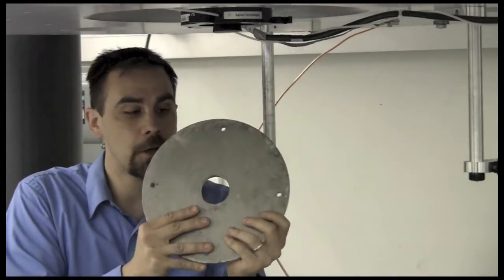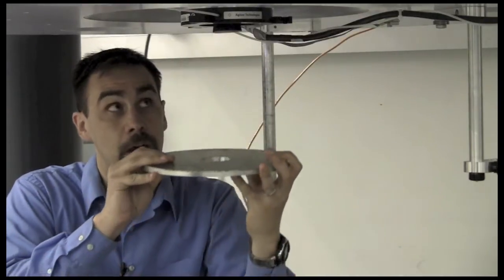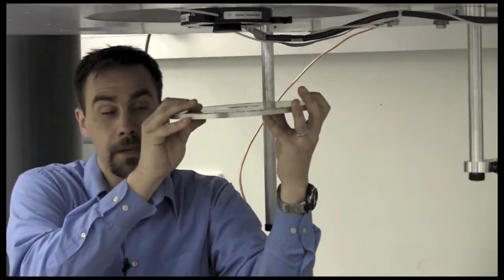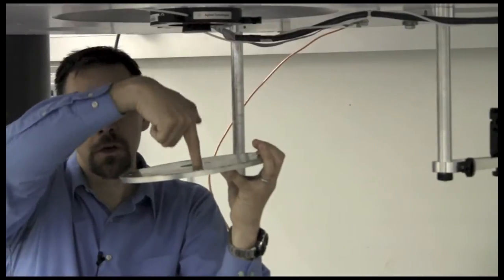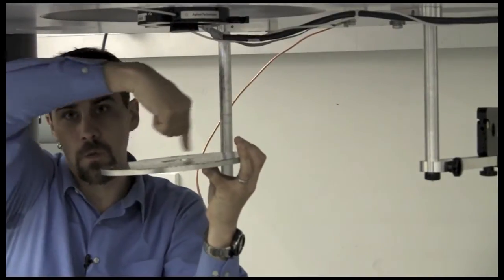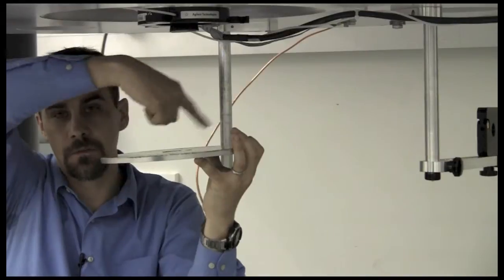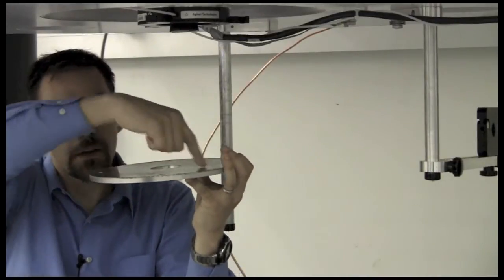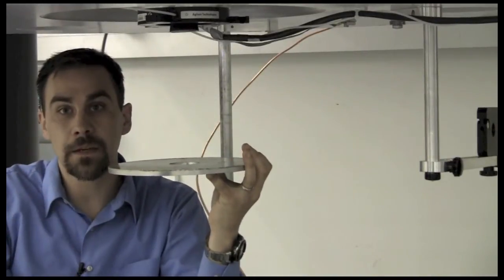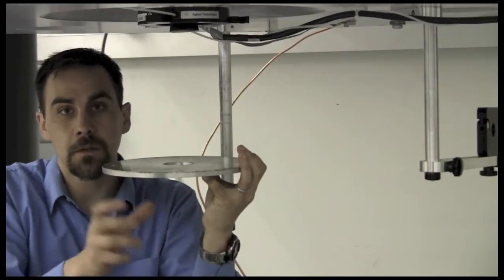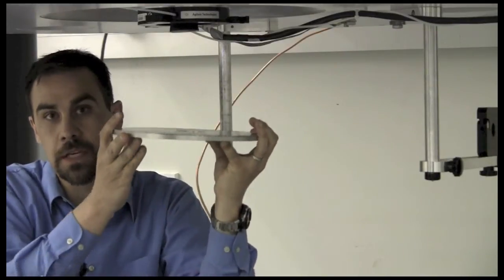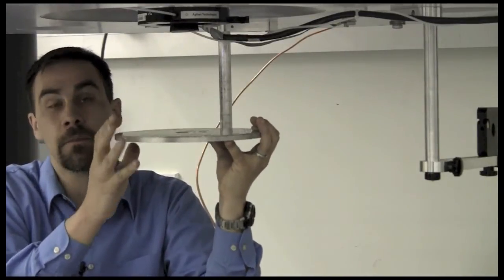However, it is a very good conductor, and when I move it up close to the bore of the magnet, the magnetic field will go through the plate and it will induce a current around the perimeter of the plate. And that current will cause its own magnetic field that will cause it to oppose any movement, either pushing it in or pulling it away from the bore of the magnet.